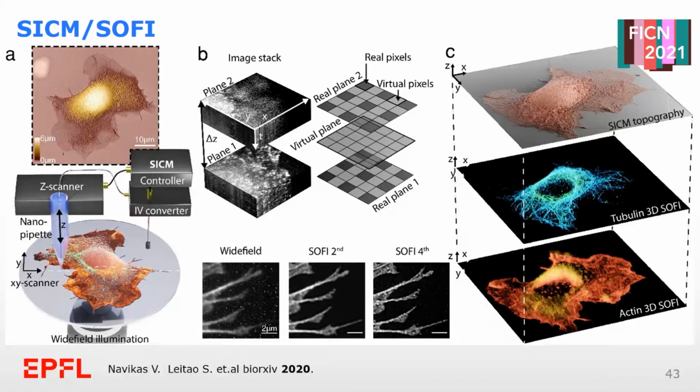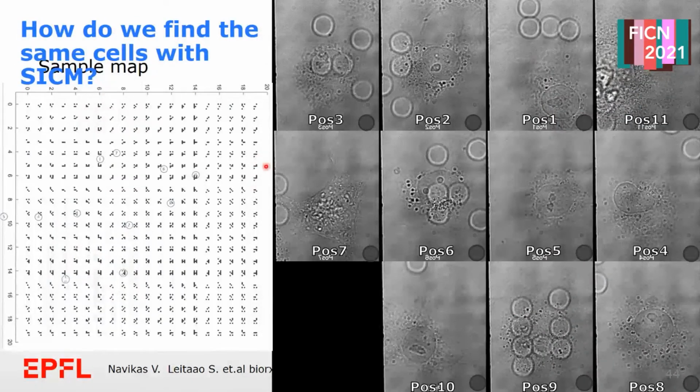In the first realization of this microscopy, we did this on two different setups, and in order to do so, we have to have some way of navigating through our samples, and for that we have prepared these marked cover slips with this binary system that allows us to find very many cells, first in the SOFI and then in the scanning ion conductance microscope, and vice versa.